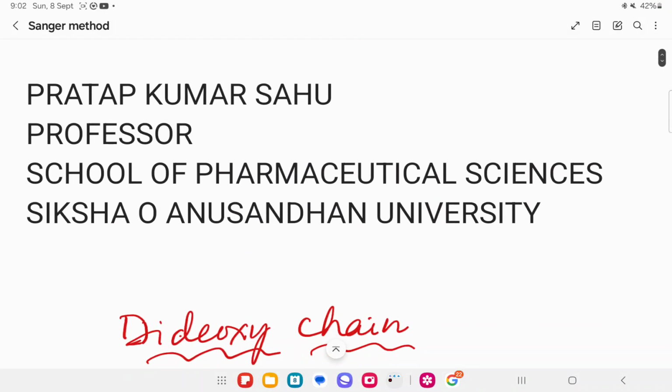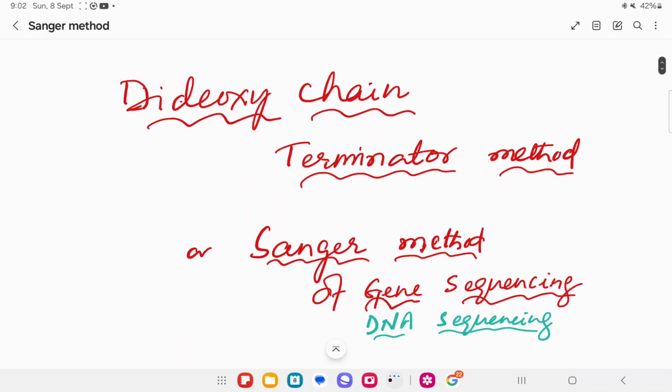Welcome to PK's classes. Today we'll study the Dideoxy Chain Terminator method, or Sanger method, of gene sequencing or DNA sequencing. There are two methods of DNA sequencing. One is the chain terminator method of Sanger, commonly known as the Dideoxy Chain Terminator method of Sanger, and the other is the Maxam and Gilbert chemical method of gene sequencing. Today we will discuss the first method, the Dideoxy Chain Terminator method or Sanger method.